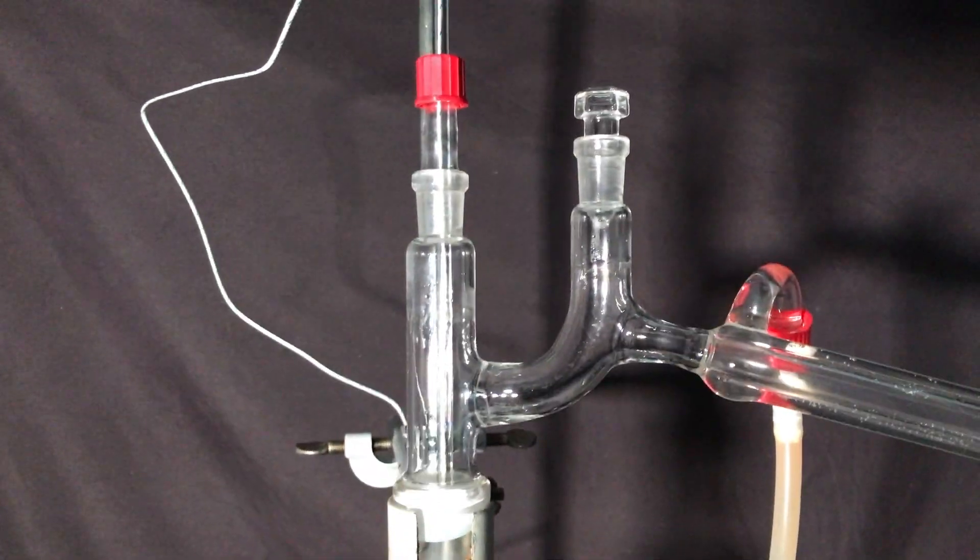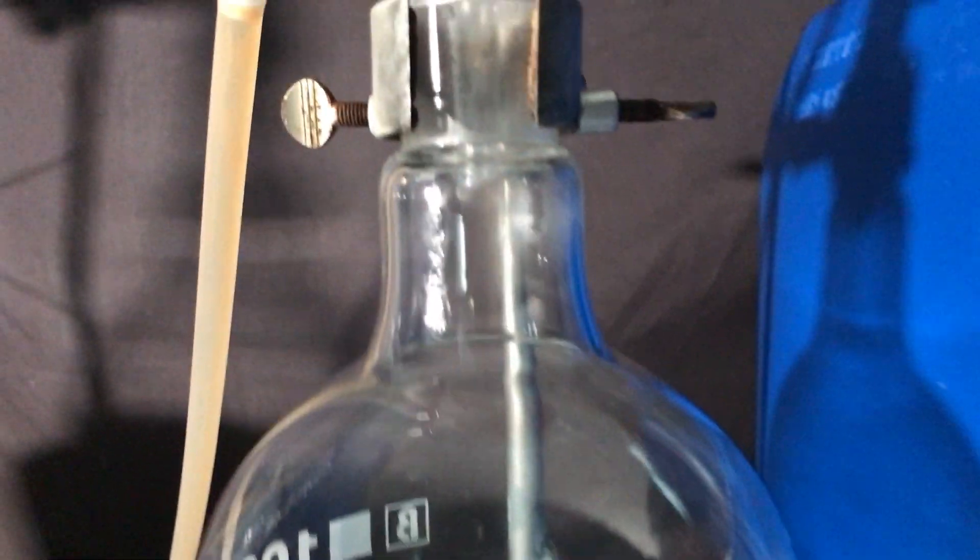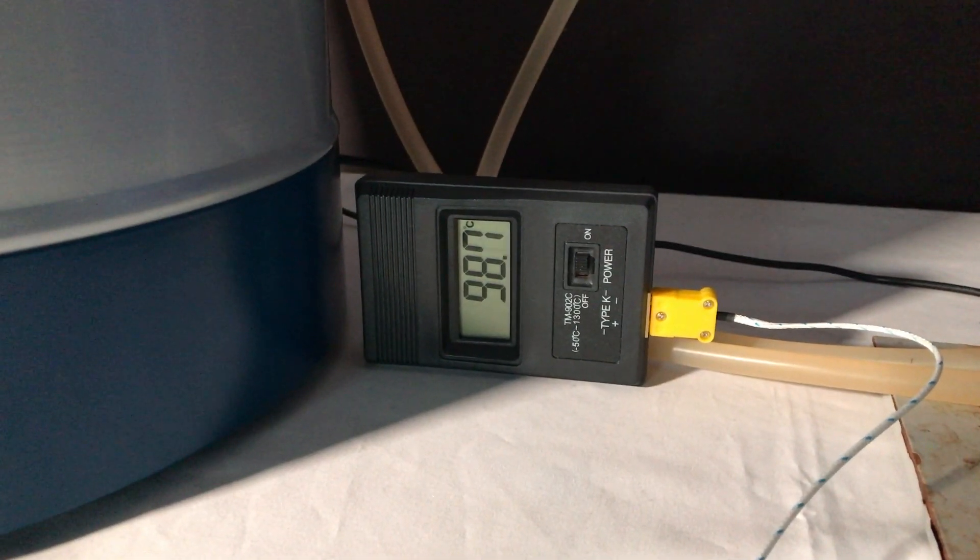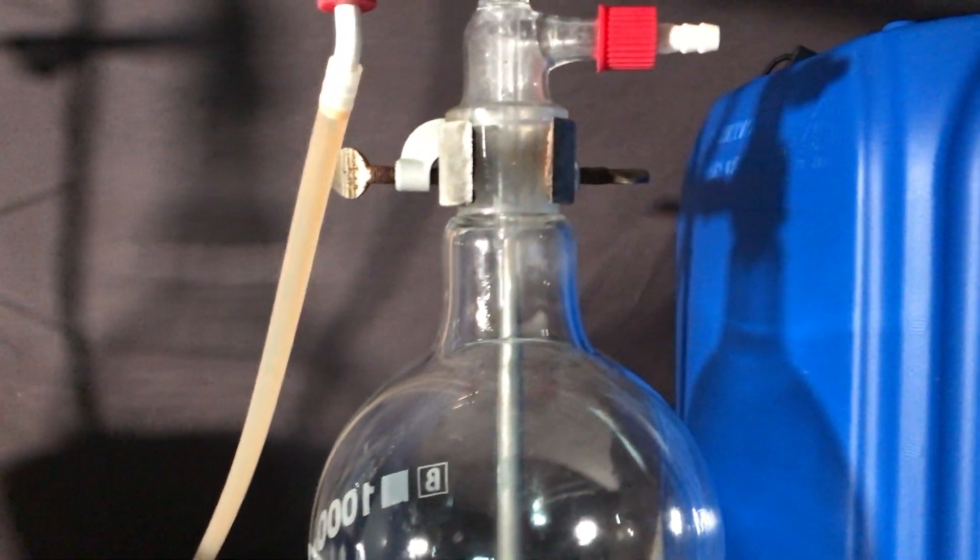I do not trust the big round-bottom flask to withstand the vacuum distillation, therefore we began by distilling off most of the benzene using a simple distillation, and the vacuum distillation will be done in a smaller flask.